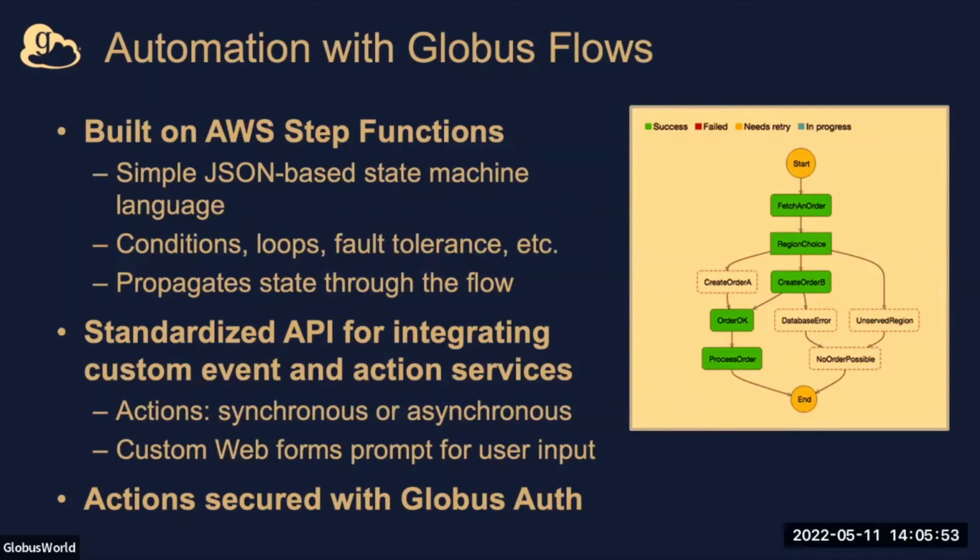There's some pre-processing or some analysis that's done, but then in that flow, there's a step that says, human, look here, review what's coming off the beamline. Perhaps they need to move the sample, refocus, whatever, and then say, yep, that looks good. Now let's run the thing for the next 1,000 or 10,000 images or what have you. So you can do all of that. And as I said, the Globus Auth model underpins all of this as well.